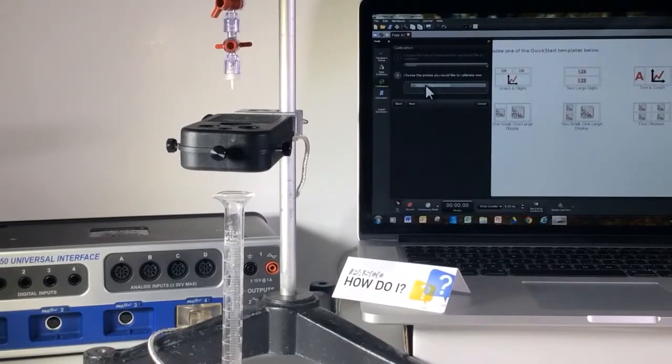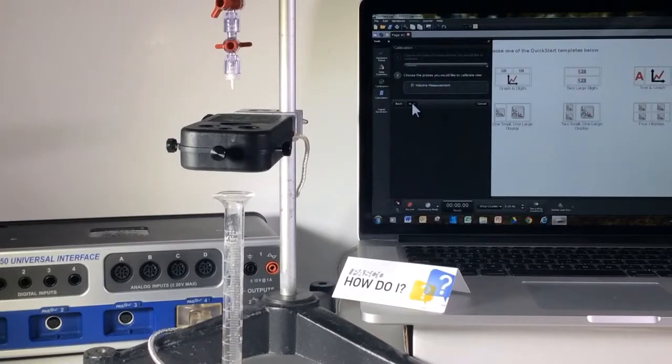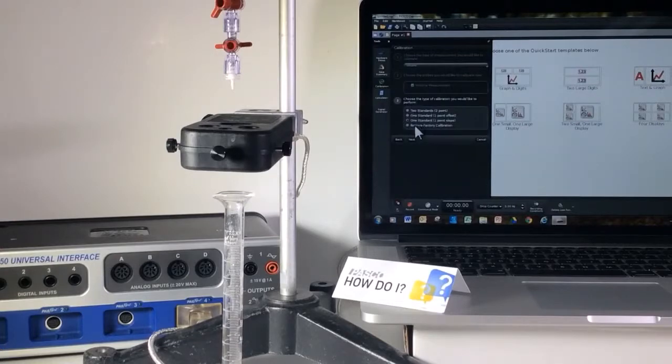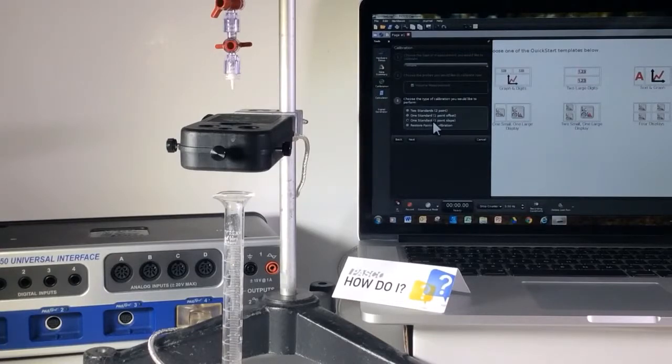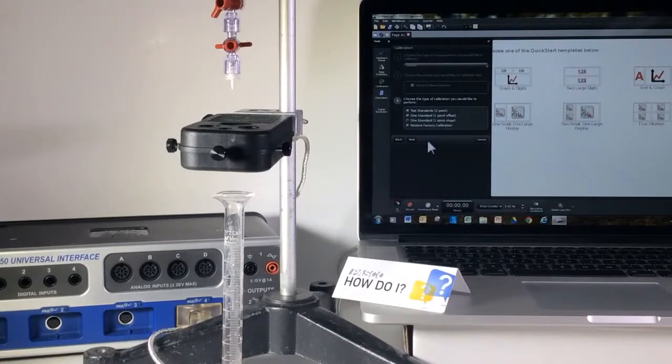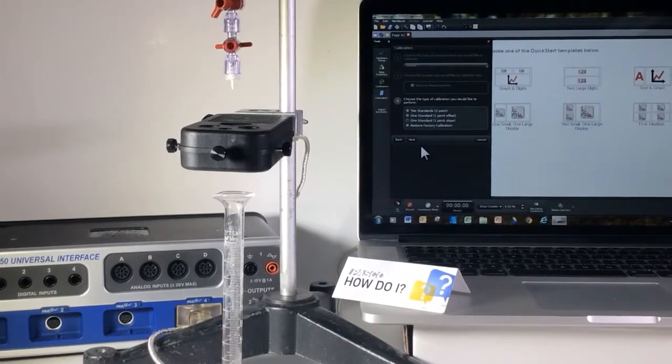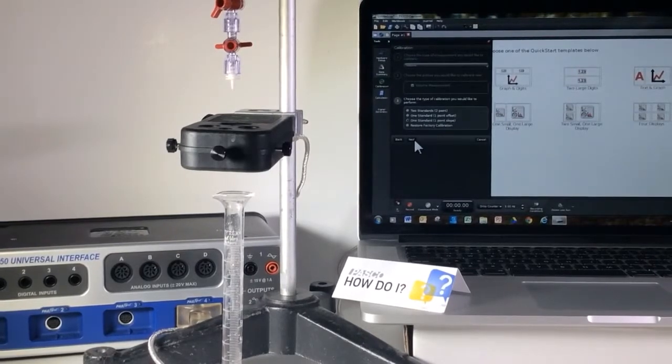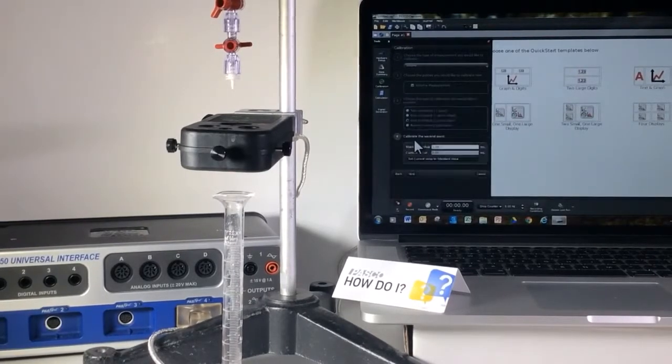Once again it's asking do you want to do a volume measurement? I'm going to hit next again. It defaults to the one standard one point slope. In general, I would always go with the default calibration.